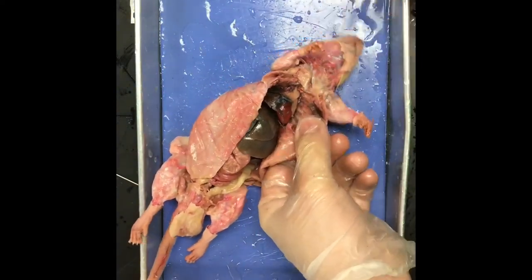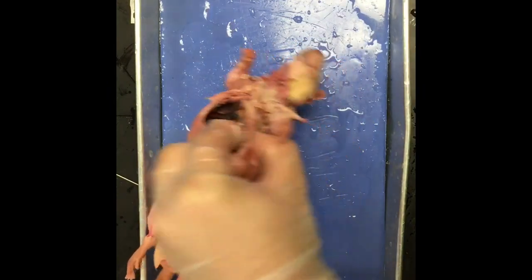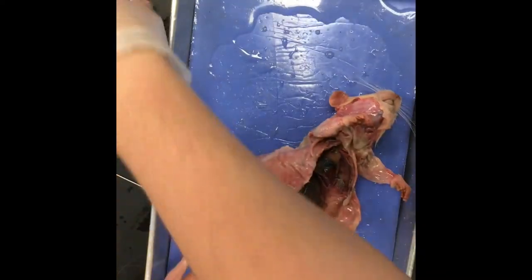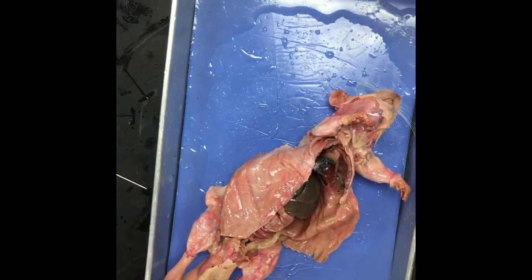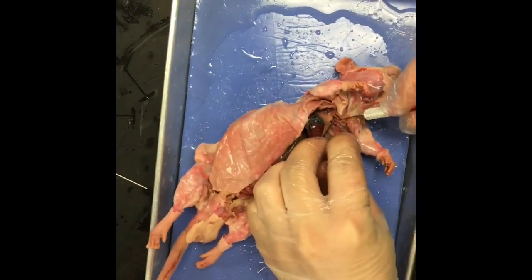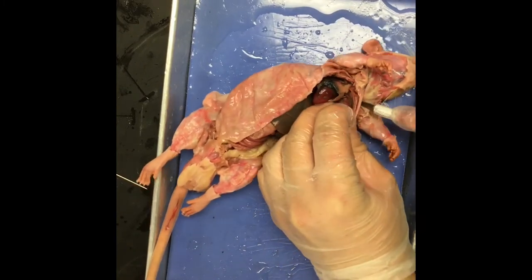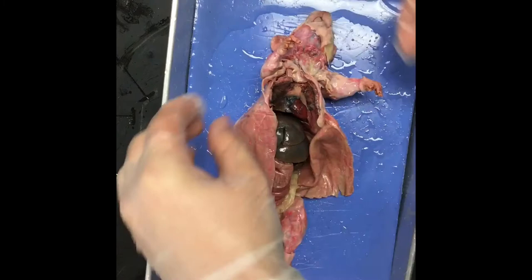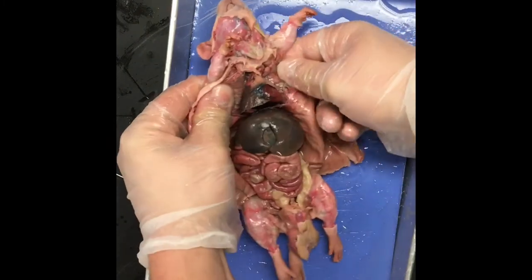Where's the heart? Is that little red in the heart? Where did my blade go? There it is. Excellent. All right, so here we go. Finish with this. Cut through the end. Costal muscles.